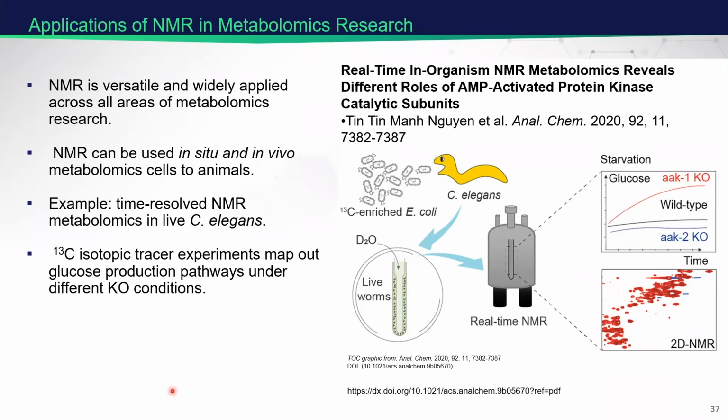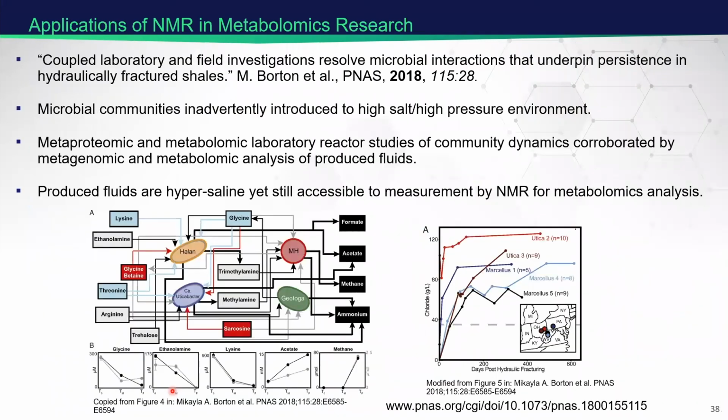Not completely unique as well. You'll find other examples of whole organism real-time metabolomics. The next three articles that I wanted to highlight were EMSL user projects. So the outside users submitted proposals to EMSL, and my colleagues in these cases collaborated and produced some really interesting studies. This particular one was looking at microbial interactions in hydraulically fractured shales.